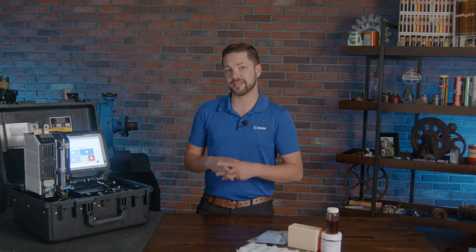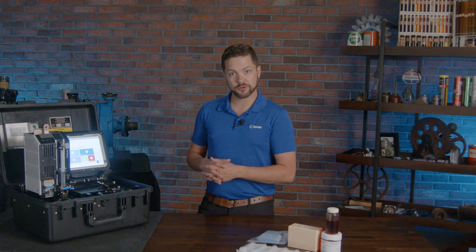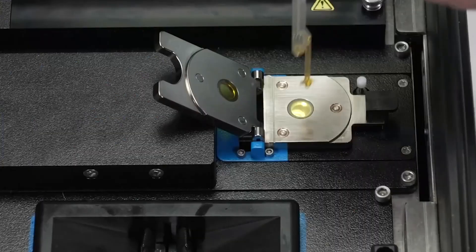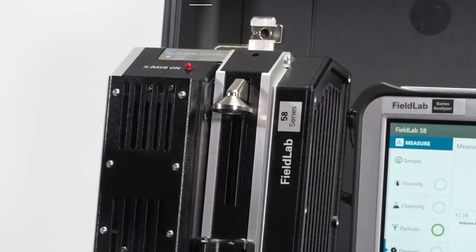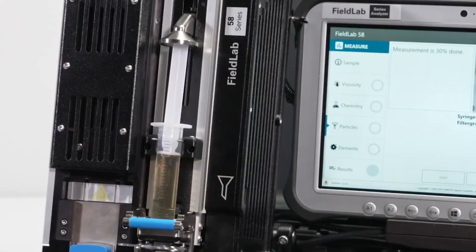We're also able to look at chemistry with a few things here — one of them is viscosity with the SpectroVisc and the Fluid Scan, which looks at other things related to the lubricant, including oxidation, nitration, and a few other things. I'll show you how all of that gets integrated into four different modules. Everything here follows ASTM procedures to ensure good consistency and accuracy.